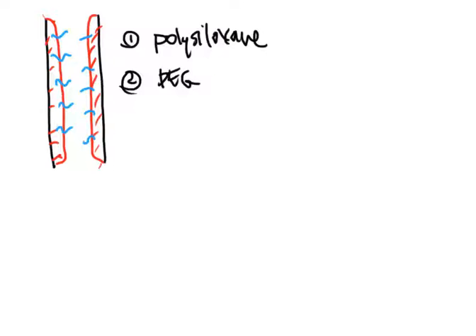All right, so here's the take-home message for you to remember and to jot down. First, traditionally, lower boiling points of molecules come off first.